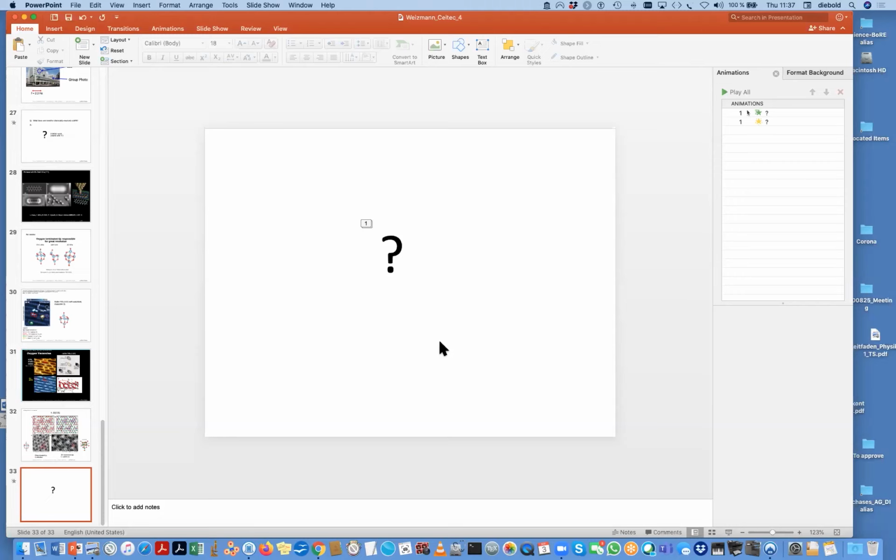It's not forgotten, but not so much used anymore. I think with this very high frequency scanning, like I showed with this one moving video frame, you can actually take movies pretty quickly. I think one problem was always how much the tip is influencing things. So maybe if you scan across more quickly, then you can have better ways of doing that. In non-contact AFM, you have to scan really super slowly. So for that one, so far, I don't think it would be possible to do that. But yes, it's still around, but not used so much. I think people go more to this fast scanning.